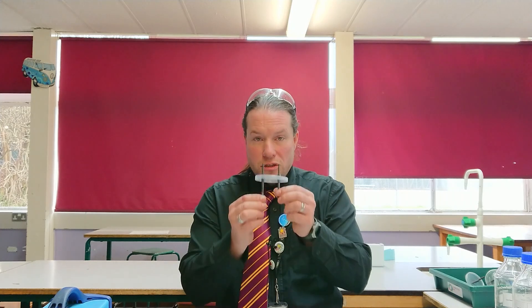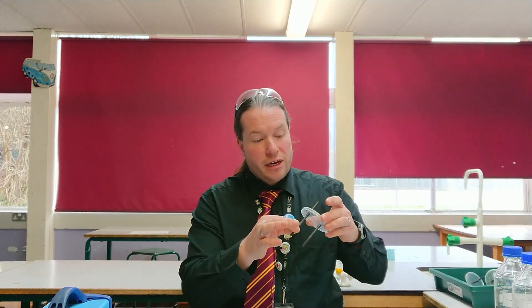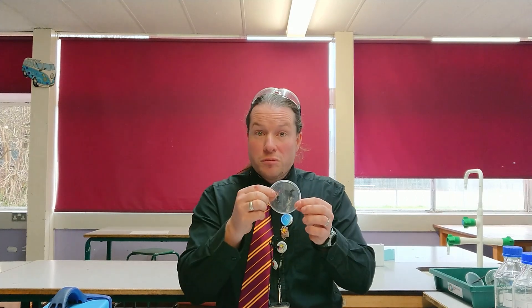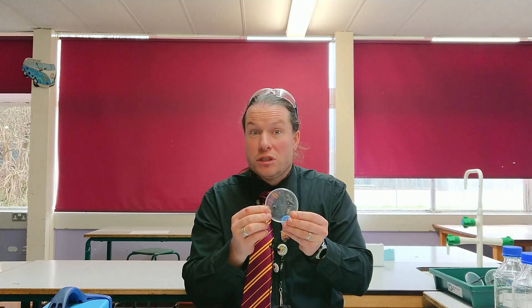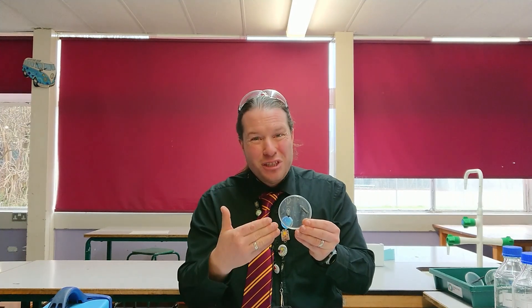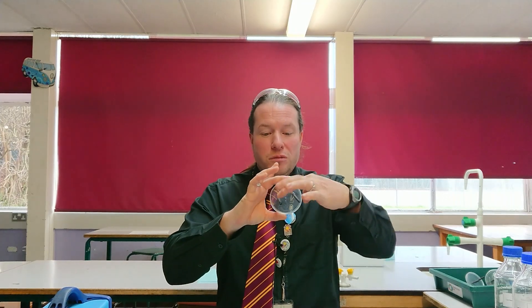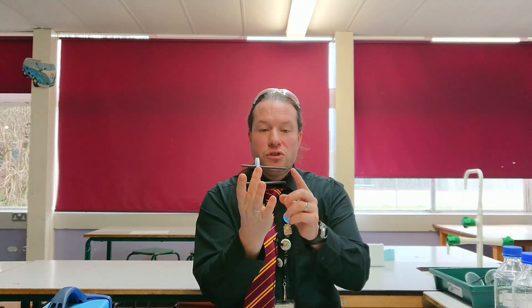We're also going to need two carbon electrodes. We have very cunningly modified a crisp lid - we've used Pringles, many other types of crisps are available, but I had to eat these so I went for ones I liked. We've modified a crisp lid to put the two electrodes through. There are our carbon electrodes.